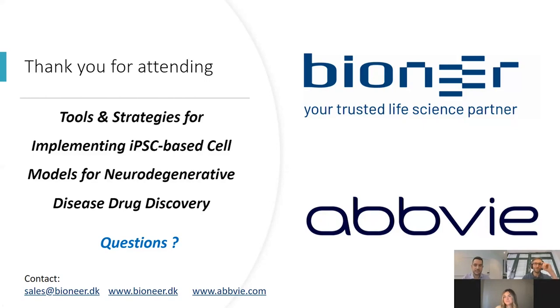Yes, we have done that a few times. However, it's much more complicated than a conventional knockout. So we were using the Cre-Lox system where we have inserted the Cre recombinase into a safe site locus. And we had then inserted LoxP sites surrounding a certain exon of our gene of interest. And when we added dox, Cre was expressed and was then looping out this exon. This is, however, much more complicated than a normal knockout, but it definitely has worked in the past, yes.